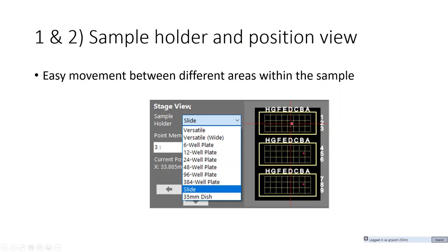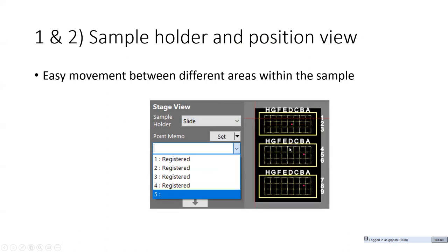As I mentioned, you can select whatever slides you want to, go and click on different areas and get done with that. However, you also have the option of storing different areas. So let's say you just want to compare three different slides that you have. And you go and set things over here, you go back over here, and you don't remember where to go back now.